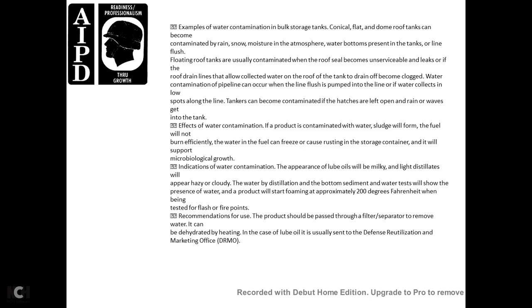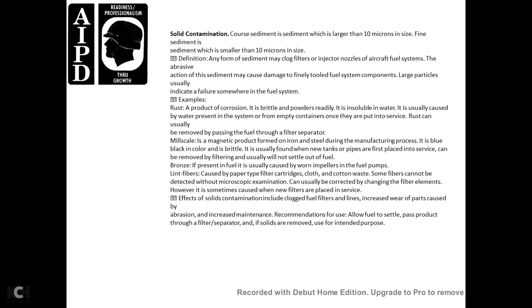Indications of water contamination: the appearance of lube oils will be milky, and light distillates will appear hazy and cloudy with water. Bottom sediment and water tests will show the presence of water in the product. It will start foaming at approximately 200 degrees Fahrenheit when beginning a test for flash and fire points. Recommendation: the product should be used with a filter separator to remove the water, or it can be dehydrated by heating. In this case, the lubricating oil is usually sent to the Defense Reutilization and Marketing Office.